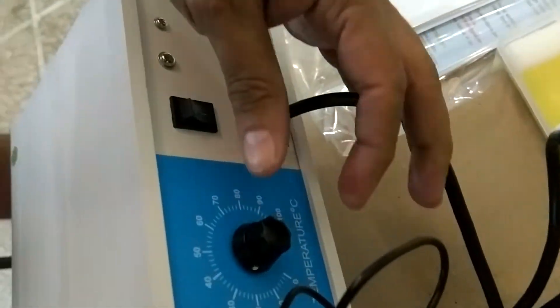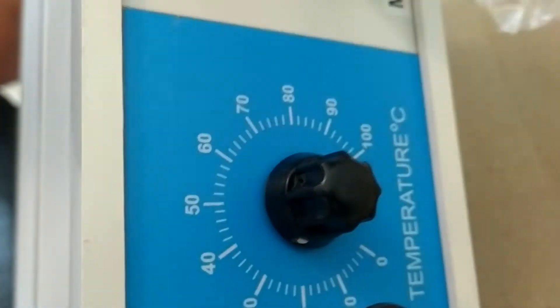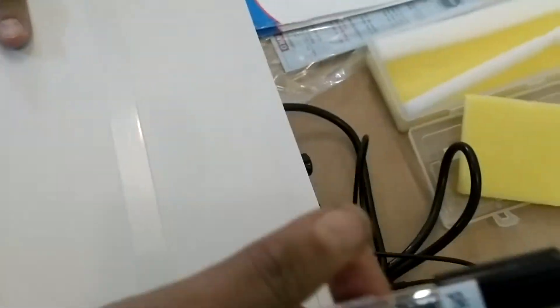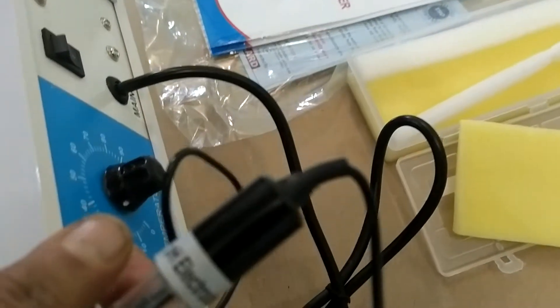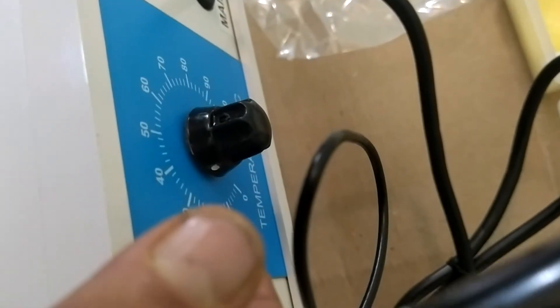And set your temperature. I am setting 25 degree standard pH temperature. You can adjust on your convenience. That's what is your ambient temperature: that is 20, 25, 30, 40. This is the switch on switch, on off like this.